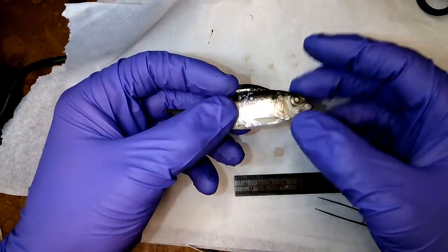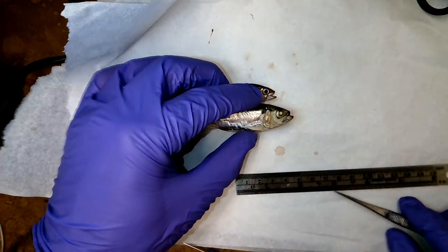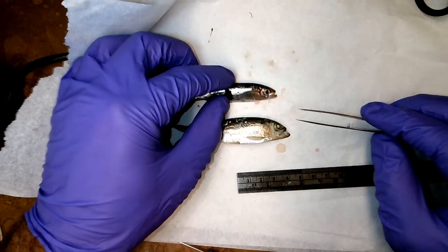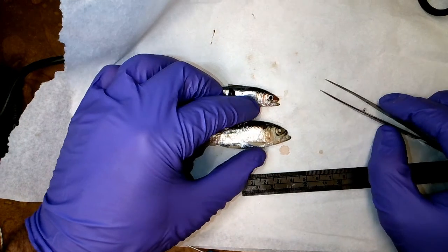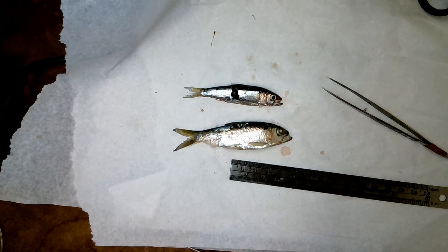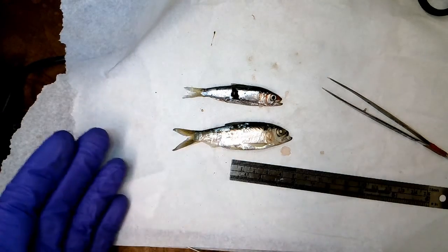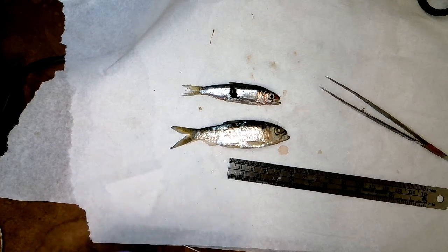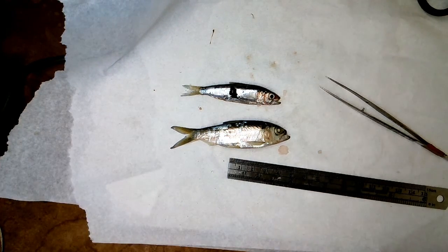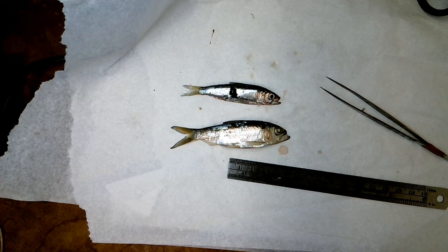Okay, we've come to find that one's probably least reliable, but certainly the jaw shape and the tongue is a helpful one as well. So these hopefully make sense to you, but we can talk more about them in class today if you have any questions. But this is something you'll be expected to do. And again, this is really tough. These are juvenile fish. It's difficult on adults. And so recognize that this is a difficult family to ID to species. So there are some tricks that can help you along the way to help you ID.